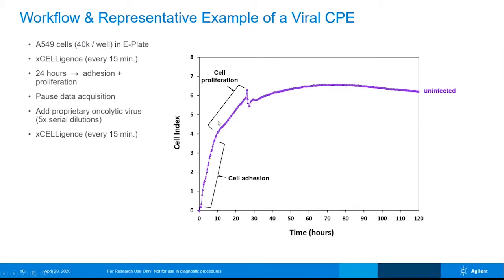You can see in this phase, typically the number of cells is increasing. And eventually the cells reach confluence, and so the impedance signal will plateau. The reason for this is that the entire surface area on that gold biosensor array has now been taken up, and so there's just no more gains to be had. Something that's really important to highlight is the fact that this type of detail, the kinetics and the magnitude of the signal, really serve as built-in quality control metrics.